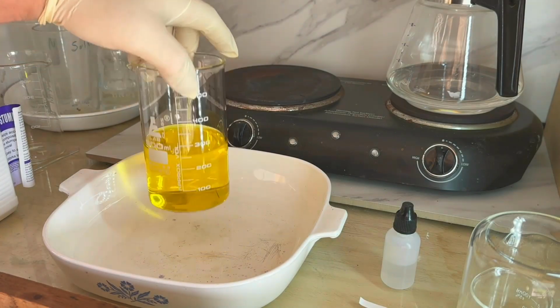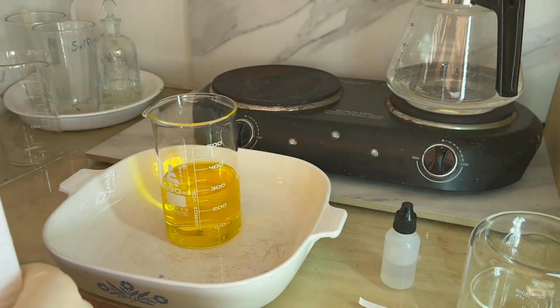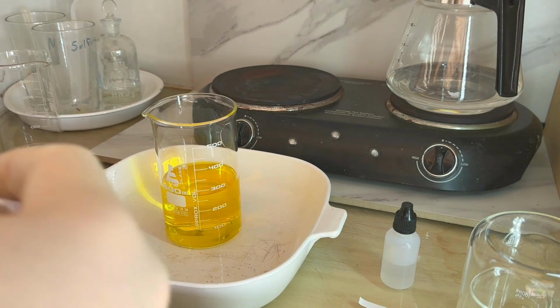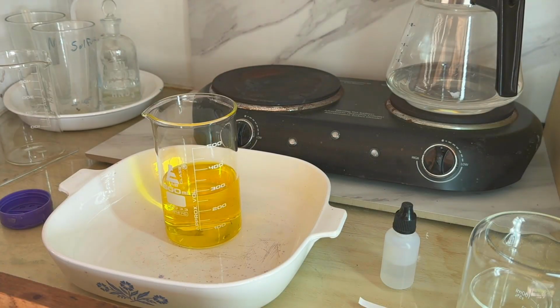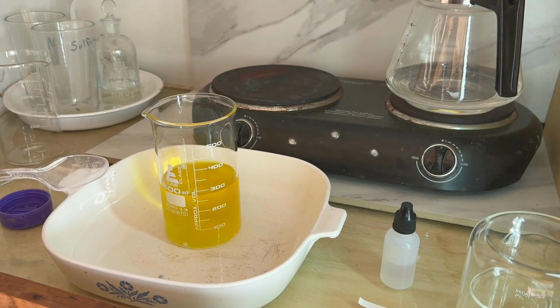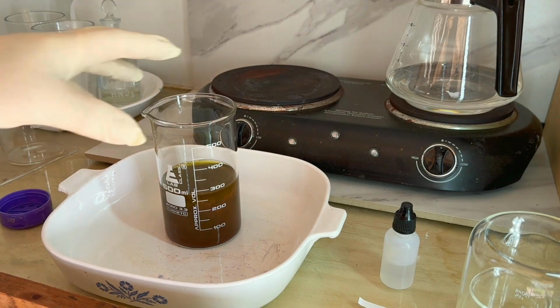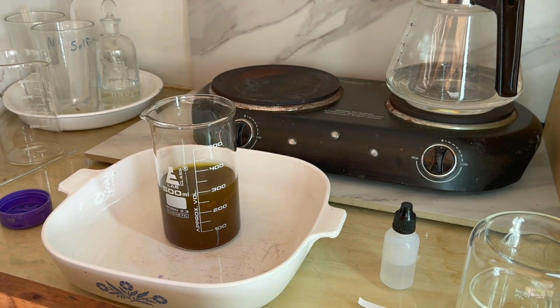All right, we have our solution. We have our SMB to precipitate. Have our testing strips and stannous chloride here next to it. And so we're going to go ahead and add some SMB to the solution. I love these nice clean drops. It goes SMB, and boom, just like that, the gold is coming out of solution. We're going to stir that around a little bit. We'll add just a little bit more.